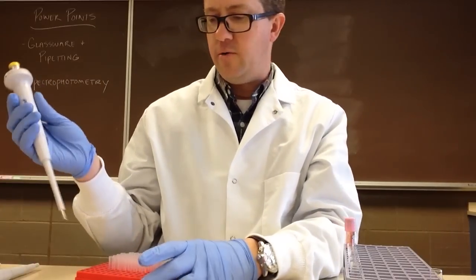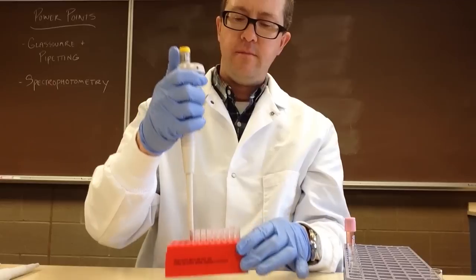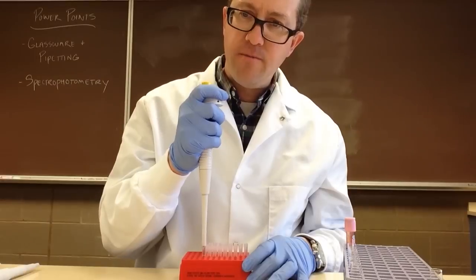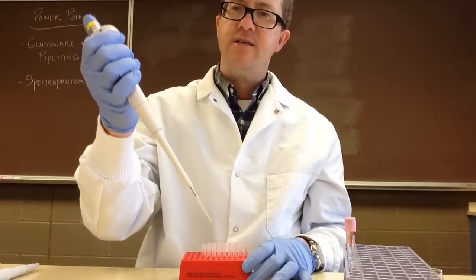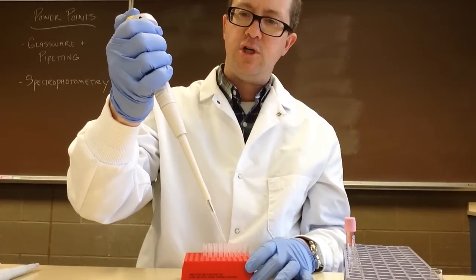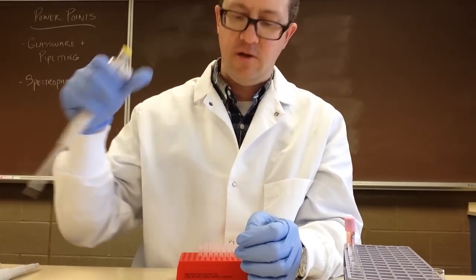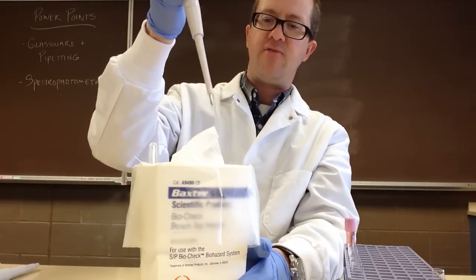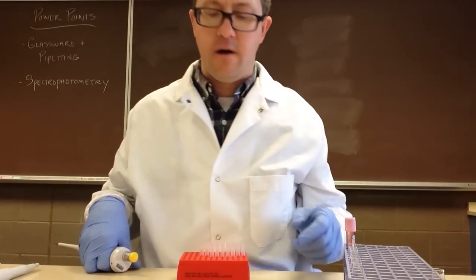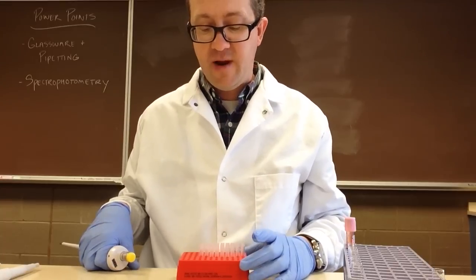Before we start the techniques, I just want to talk about loading up our micropipetter. Each micropipetter comes with a specific tip. To put a tip on, you give one firm push down and it's on. To eject it, you push all the way down until it comes off. Usually we don't eject those into the palm of our hand — we would eject them into a biohazardous trash. Micropipette tips are generally not considered sharps and don't need to go into the sharps container, however always consult your facility's policy.